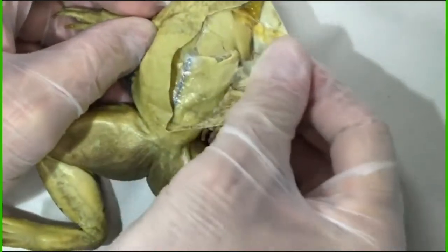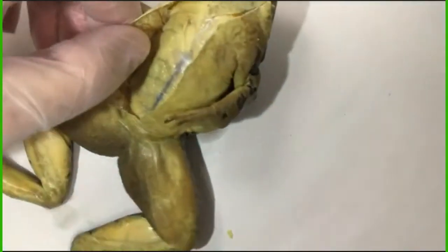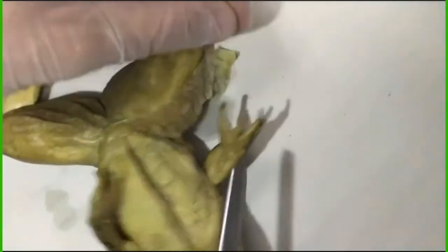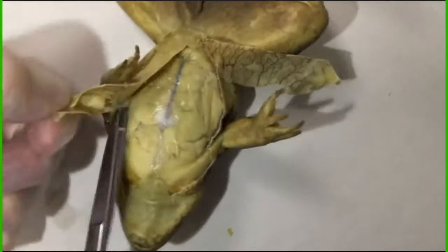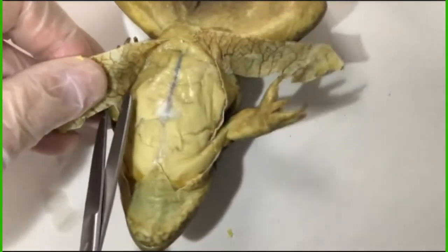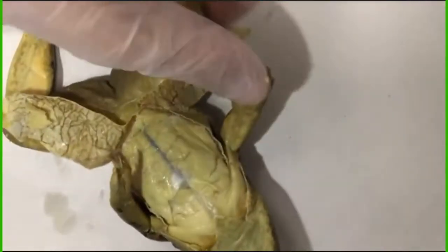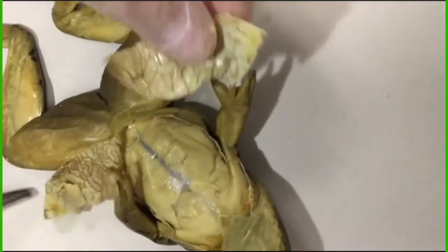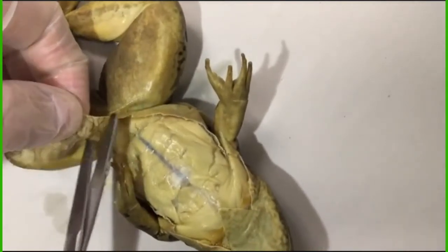And then kind of pulling it apart just to get it away from the muscle, so that I can trim it away on the sides. So that's what I'm doing next. And if you'll notice, once I'm done trimming, and I'll even show it on the video, you can really see a very large, extensive network of blood vessels underneath the skin. That's what you see there, all the little lines. So we don't need the skin for the dissection, so we're snipping that away. There you go. There's your vascular network underneath the skin.